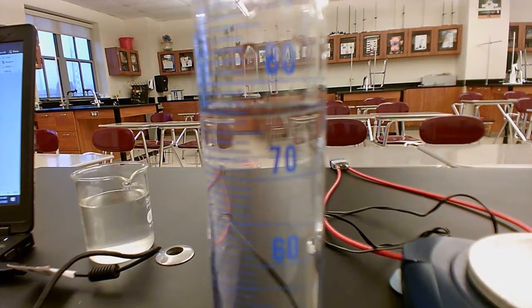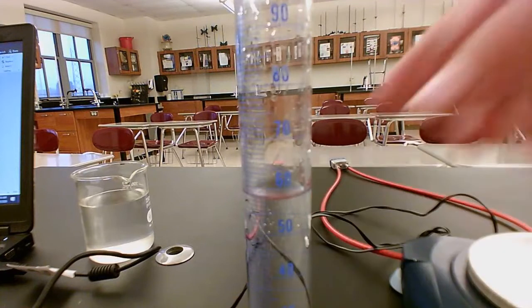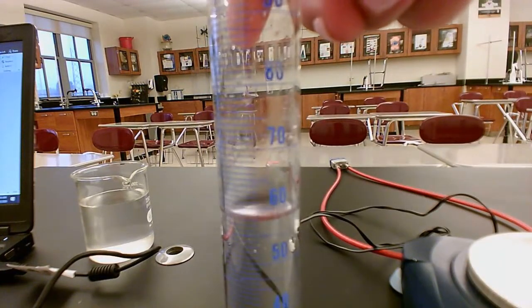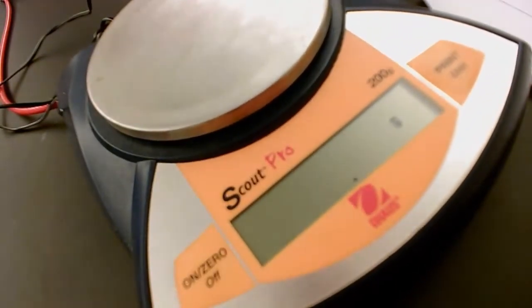All right, so now hold on, and we're going to do part C, sample B. So there's a lot of bubbles in this. Let's get them to rise to the top. All right, so while that's settling, we are going to zero out our balance.